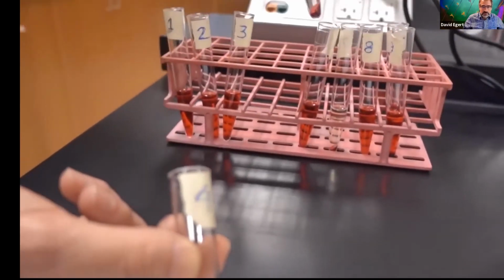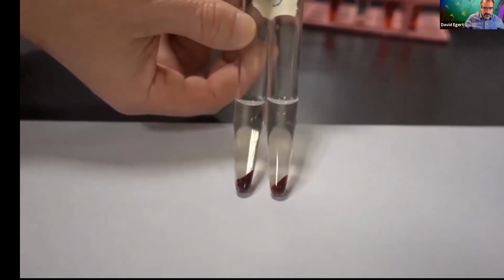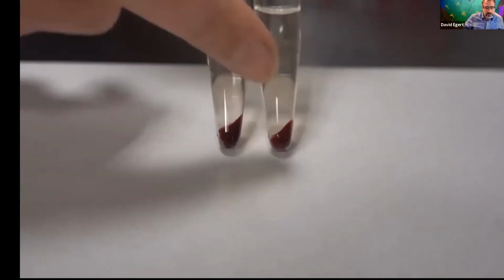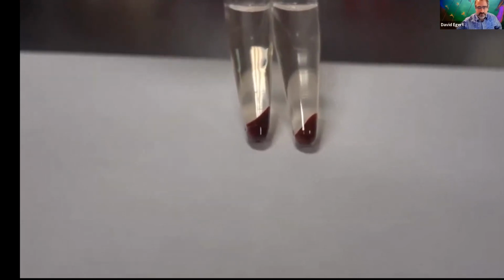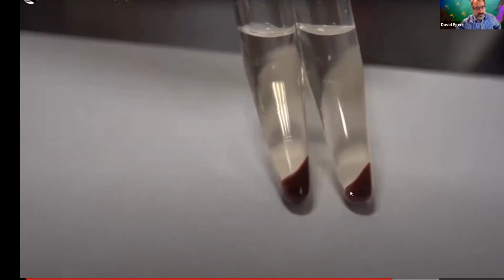This is the 0.6 osmolar solution, the really hypertonic solution. And here we see also the cells are intact, no cells exploded. But I don't know if you can see from your point of view there. Like I can see from my point of view, a pretty... Yeah, actually, you can see it pretty well.